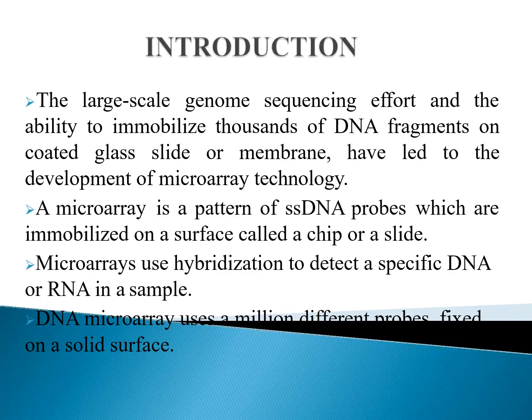Introduction to DNA microarray. With the advancement of DNA sequencing techniques, we have come to know about the whole genome sequences of many prokaryotic as well as eukaryotic organisms. Along with that, we are now able to immobilize thousands of single-stranded oligonucleotide DNA sequences on a very small surface of a glass slide or a membrane. So this technique has led to the development of microarray technology.